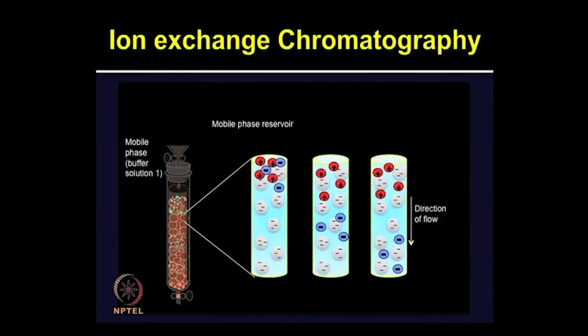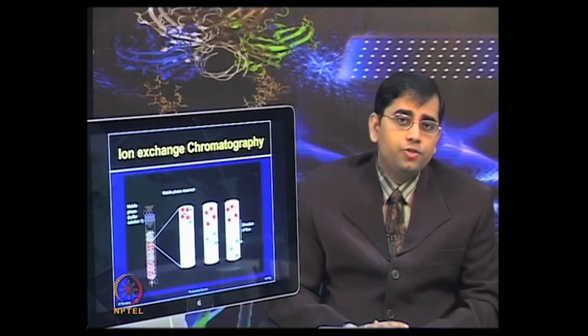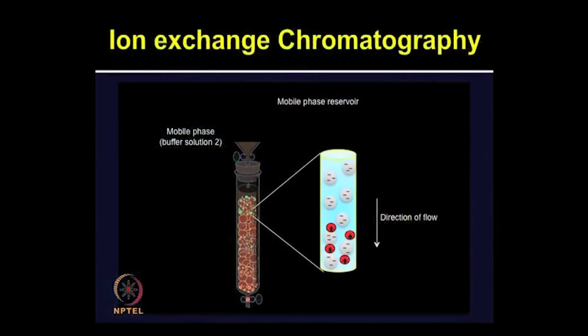Proteins are adsorbed to the ion exchange column, and then they can be desorbed by increasing the salt or altering the pH of the buffer, which can change the charge on the protein. Various anionic buffers such as acetate and phosphate are used for cation exchange, and cationic buffers such as tris chloride or ethanolamine are used for anion exchange.